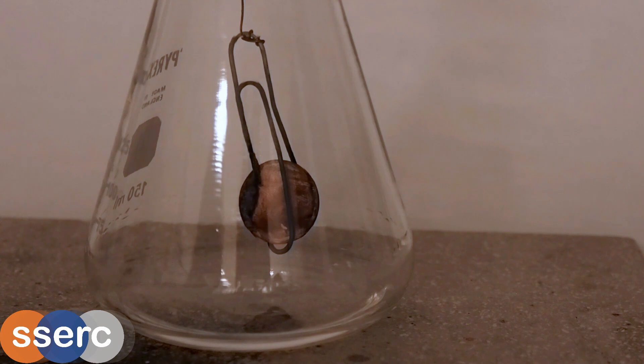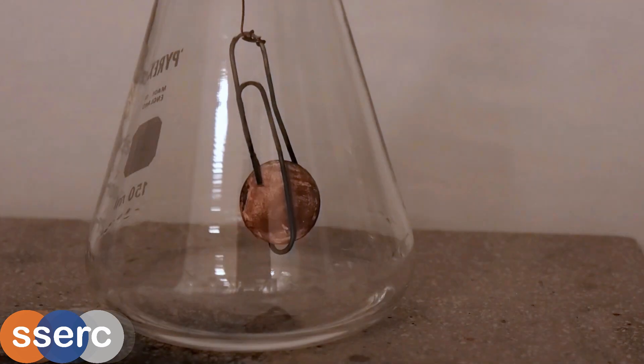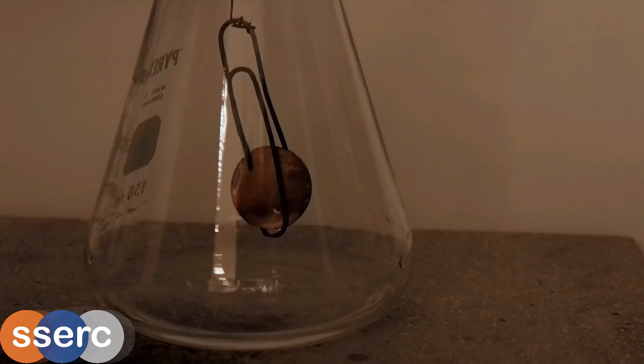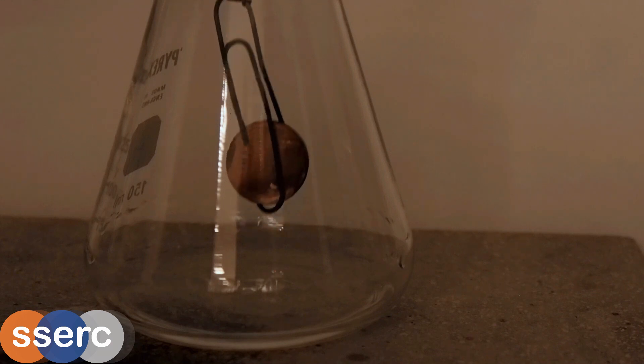After a while you notice bright patches flickering over the surface of the copper. More noticeable if the lights are turned down. If you carefully smell the vapors at the top of the flask you will notice a definite scent of ethanal.